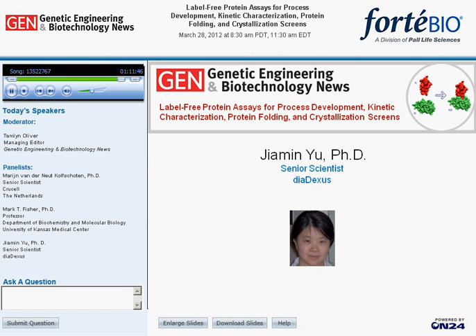It also tells you which construct you want to move forward with, which one has the best soluble expression, and also good quality protein that you can isolate right away. So in other words, even if the proteins are not aggregated, like the example 2 that was provided, you can pick out the one that was expressing the most soluble protein and move forward with.